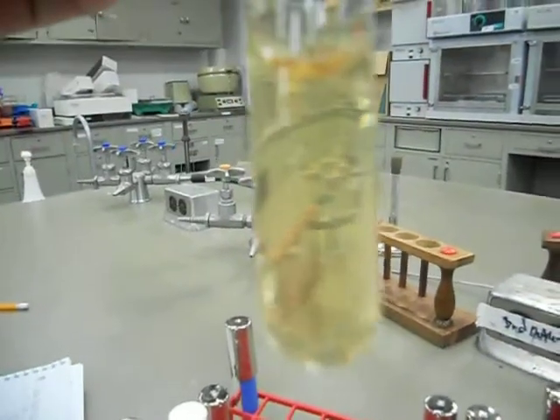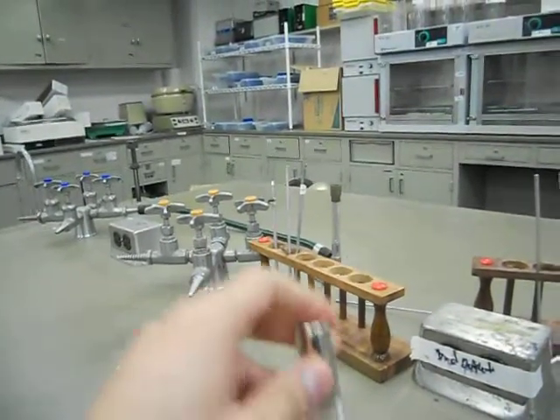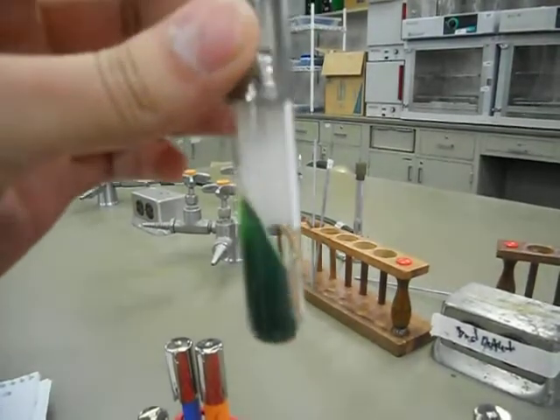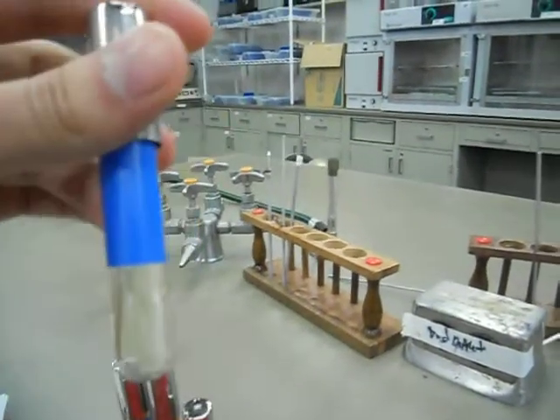What's this? Gelatin. This is citrate — dark. Citrate. The colors — is this just nutrient broth? Yeah, it's clear.